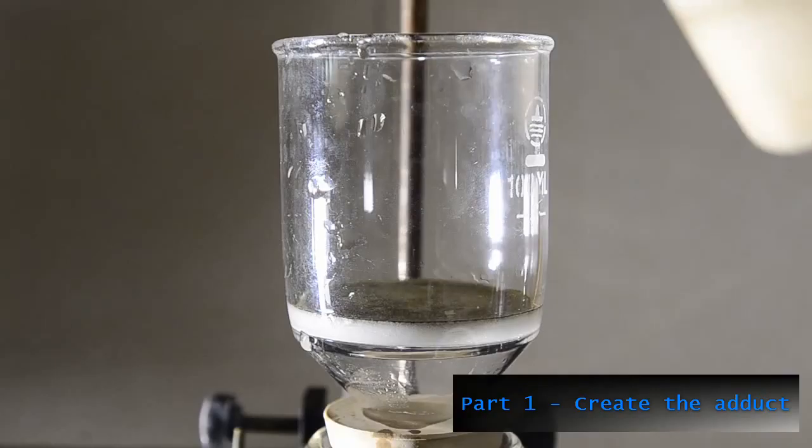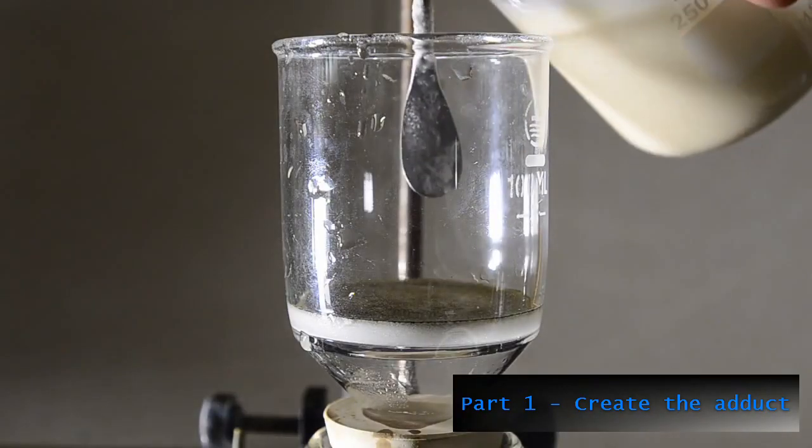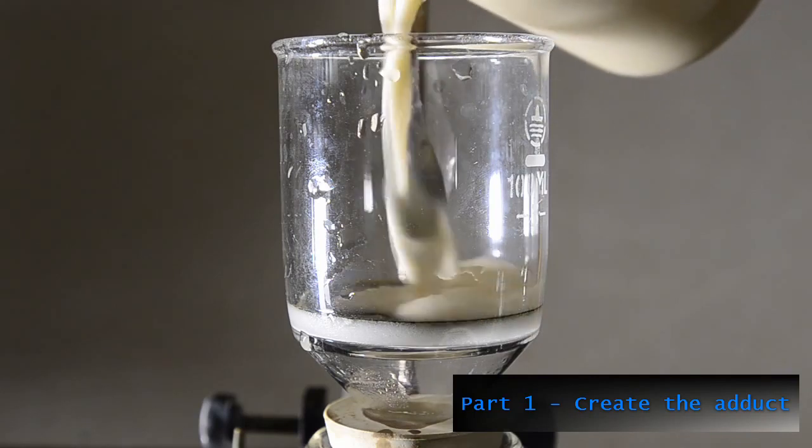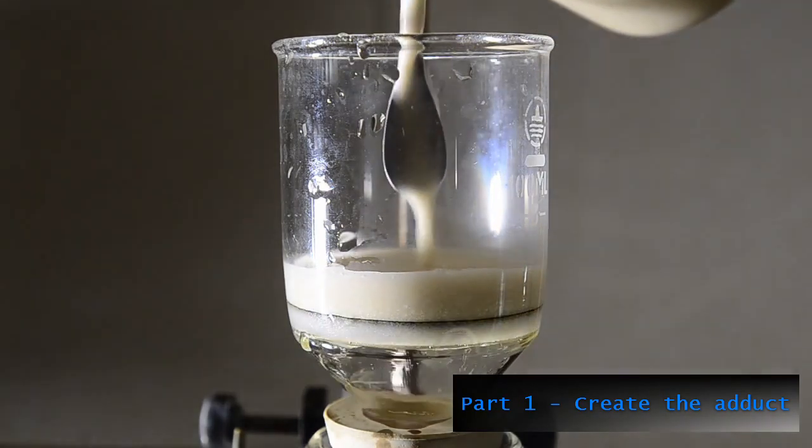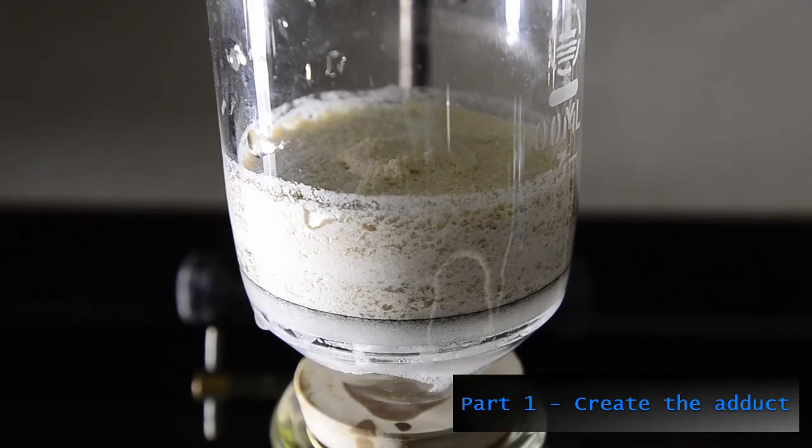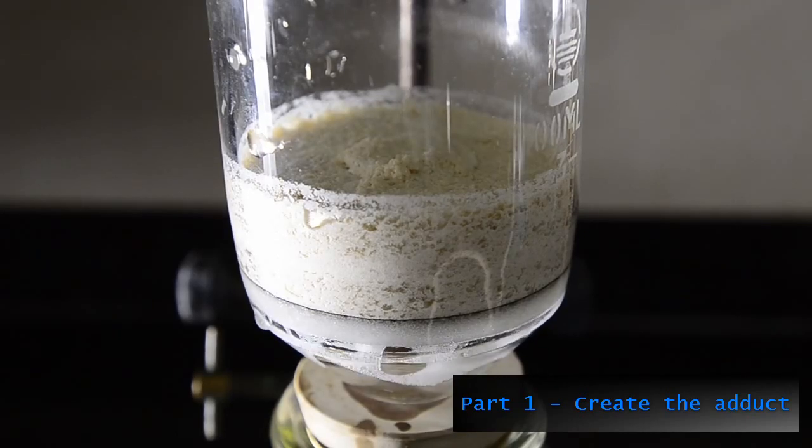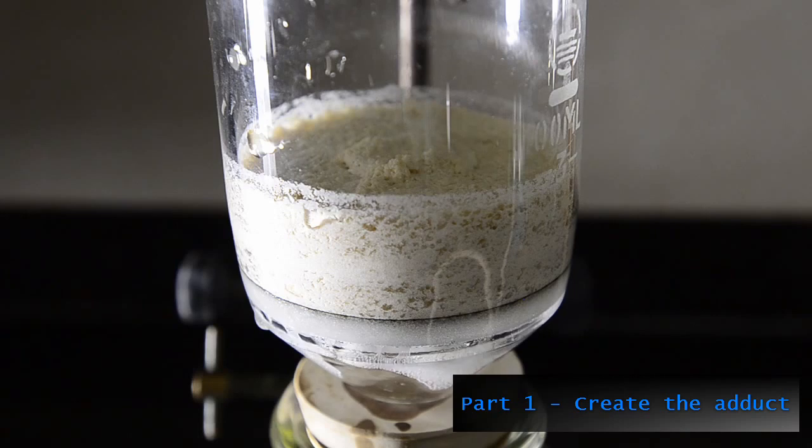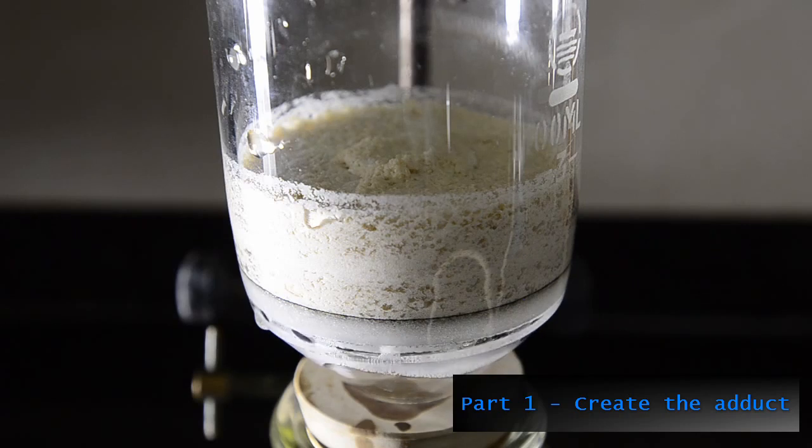Filter the precipitate, allow to dry and then wash with 10 milliliters of cold water. It's worth noting that if you ever want to purify an adduct such as this, you can wash it with cold ether or dichloromethane in order to remove unwanted organics without dissolving the adduct.